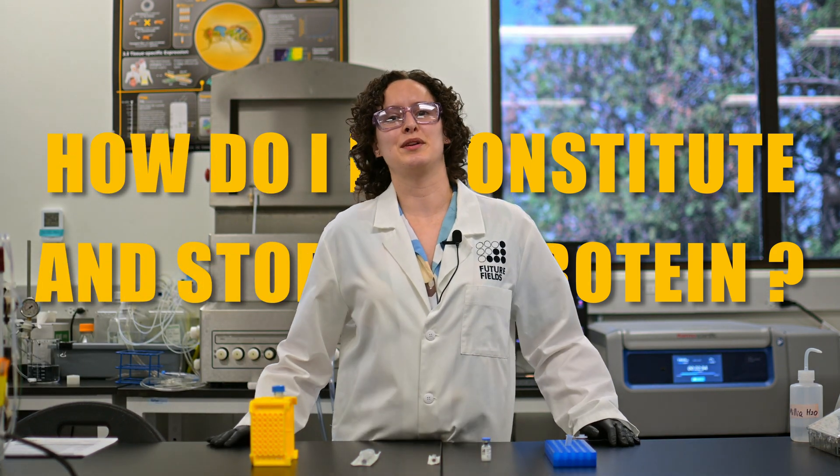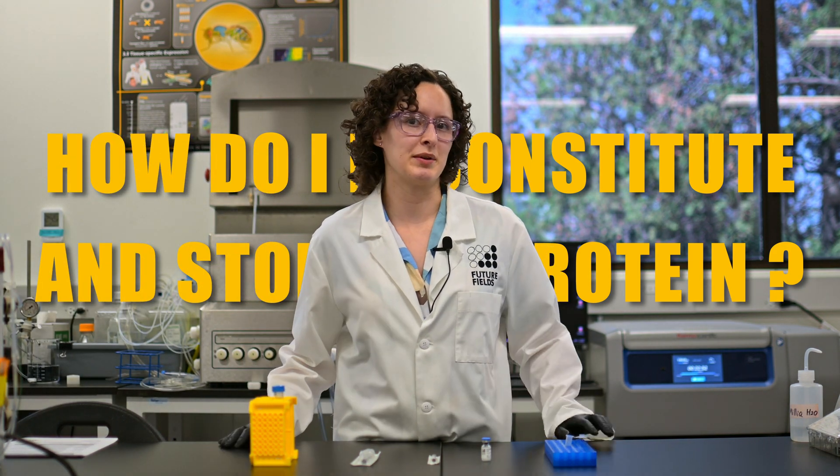How do I reconstitute a protein? This is a common question that we get from our customers. I'm Paige, a senior research scientist at Future Fields, and I'm going to show you our recommended process for reconstituting your lyophilized product.